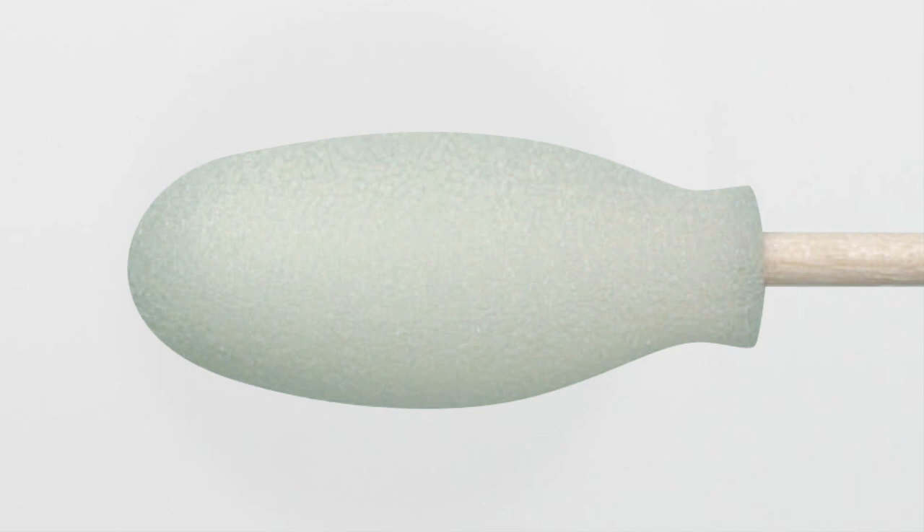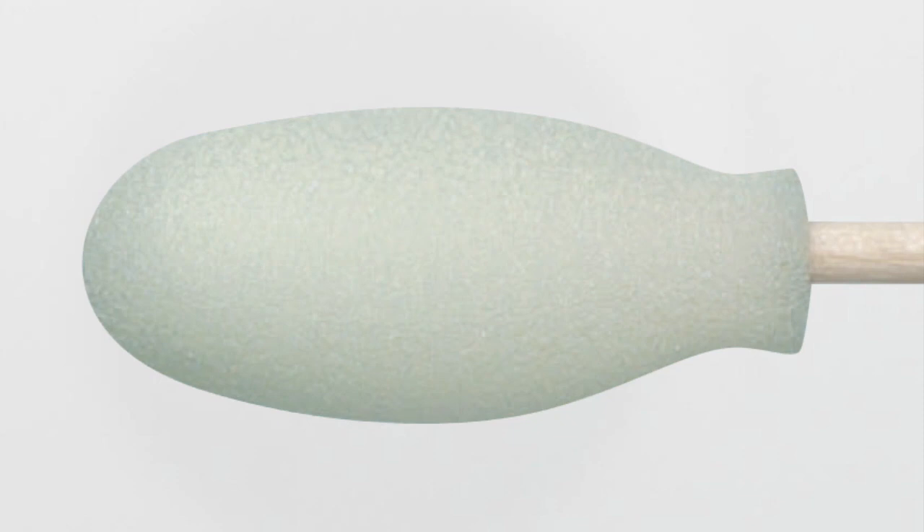This foam-covered cotton swab is designed to maximize the characteristics of cotton. These swabs are bonded together securely to a wooden shaft by an aqueous base adhesive.